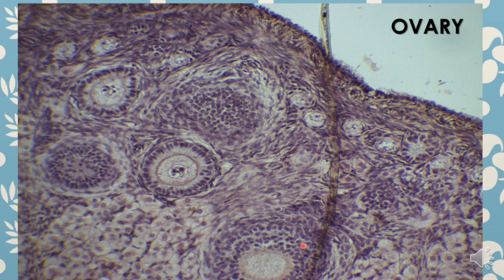You can see between the primary oocyte and the granulosa cells these layers of non-cellular glycoproteins, called the zona pellucida. The zona pellucida, a non-cellular glycoprotein, lies between the primary oocyte and the granulosa cells.